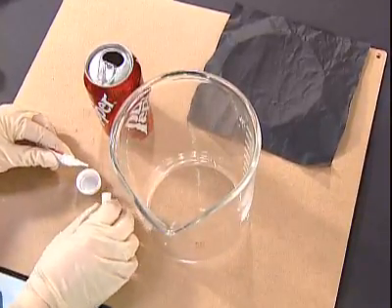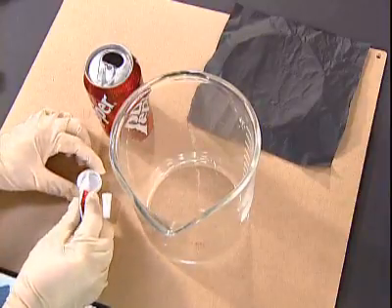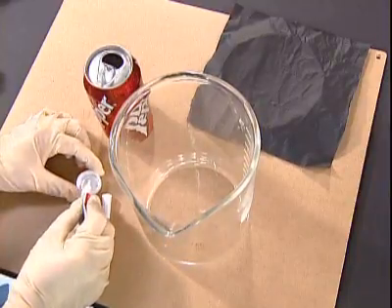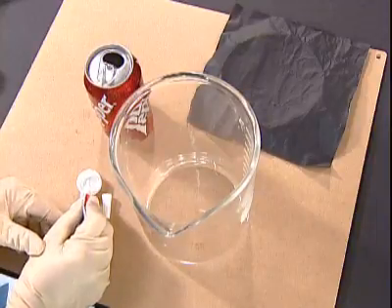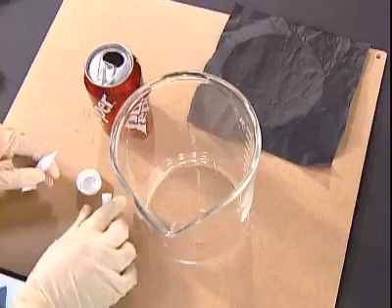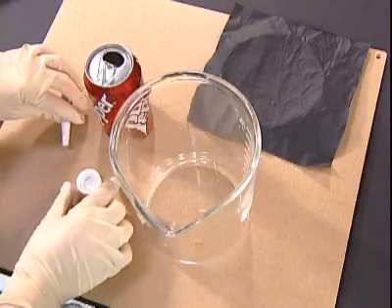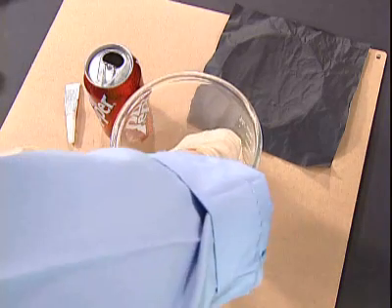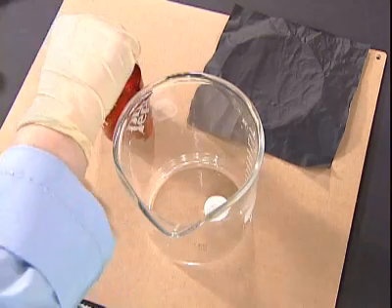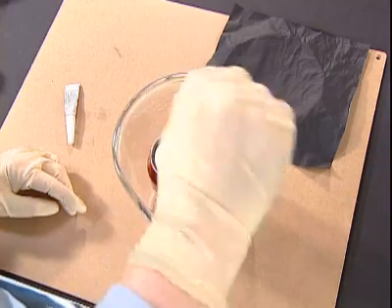It's always good to do this with supervision, especially for younger forensic scientists, then again some older ones too. And put several drops of the superglue in the cap, carefully not sticking your fingers together. Placing this in the tank and then putting our object inside the tank as well.